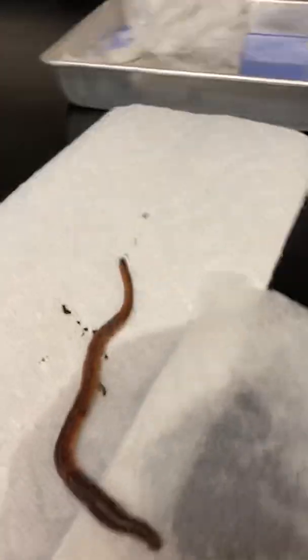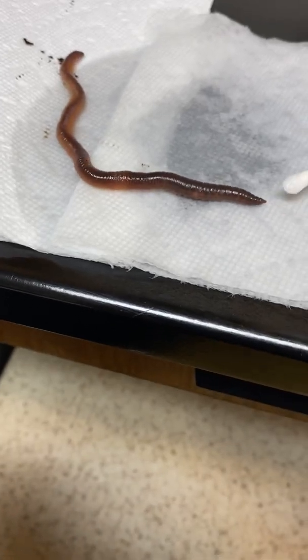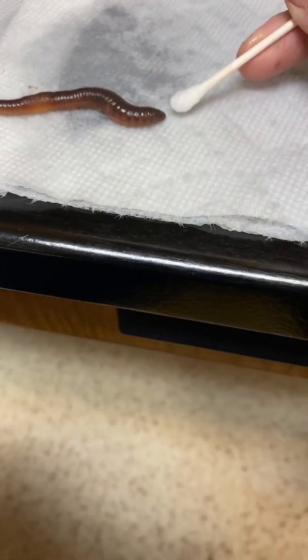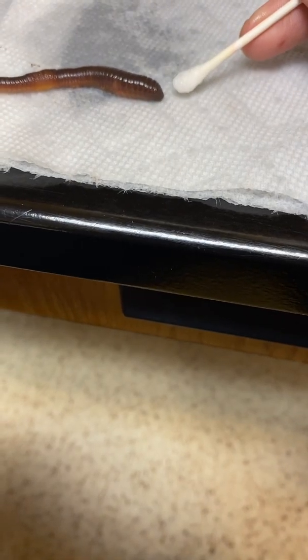Response to chemicals. I'm going to dip a Q-tip in some isopropyl alcohol and put it near his head and see what happens. We cannot put it on their skin because it's toxic. Come on. Oh, do you see that? He turned away from it. So it can't touch their skin. I can put it towards the head.